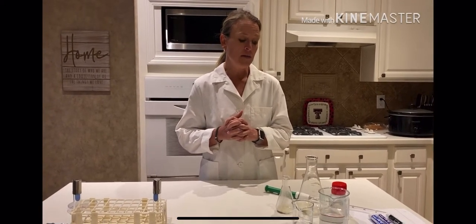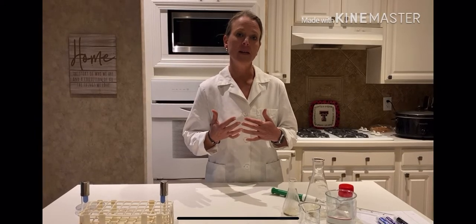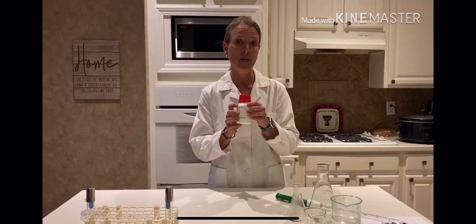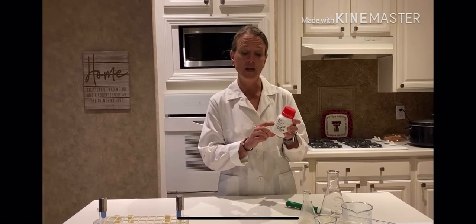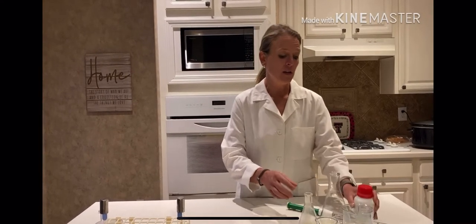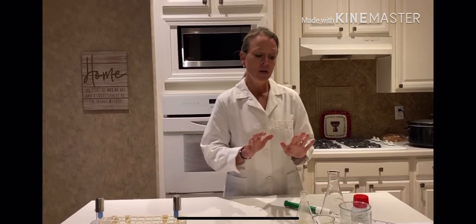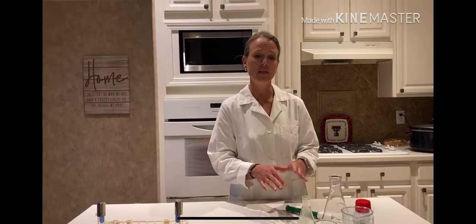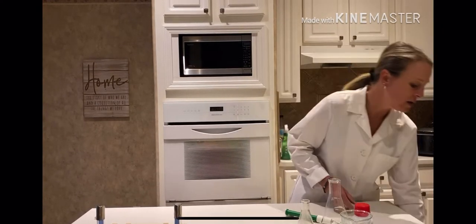When making nutrient agar and nutrient broth, just like anything else, there is a recipe on the actual powdered medium. So if you look at the medium, you can see what the recipe calls for. We're going to start off by making some nutrient broth. For this particular lab, we've already measured out the amount of powder for you, so really all you're going to have to do is add some water to it. But let's go over the calculations.